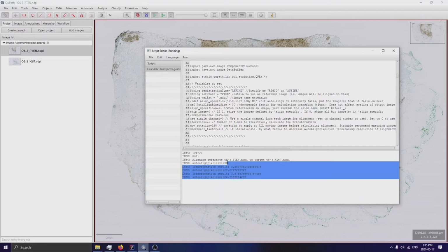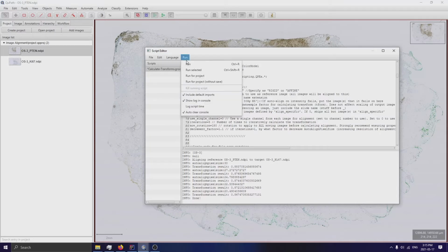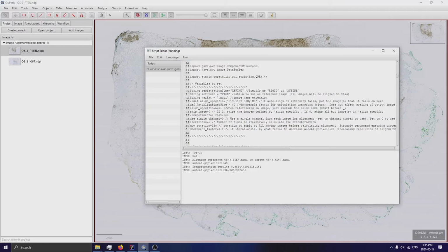All right, so it's starting off at 88% accuracy. It's using a slightly higher resolution. The accuracy does decrease slightly. How can we improve this? What if we bump it up to 40? 88, 88, 88, 83, 87.